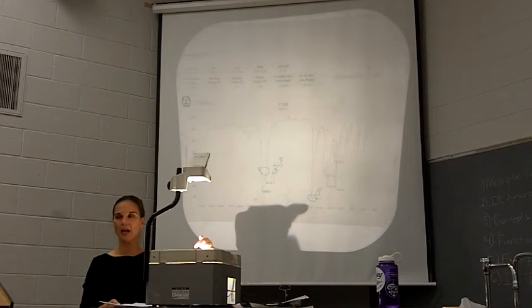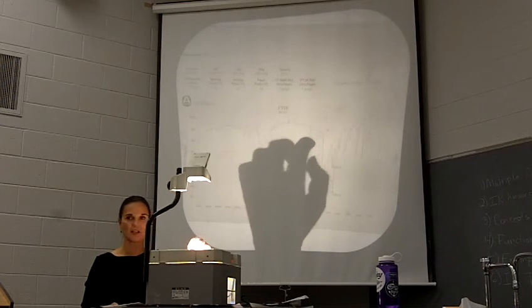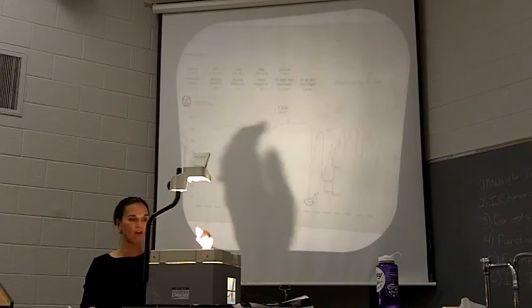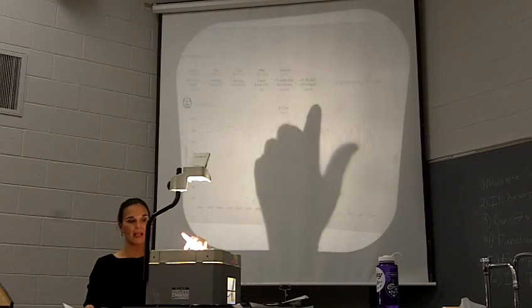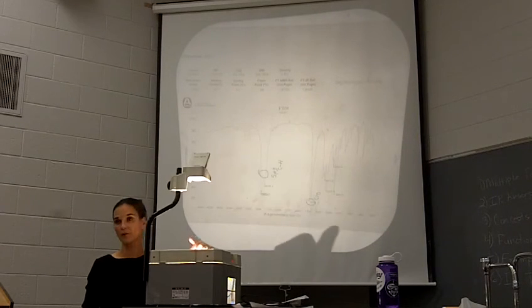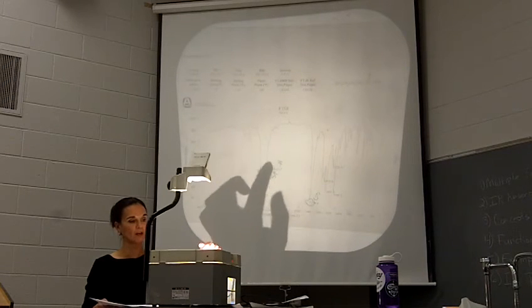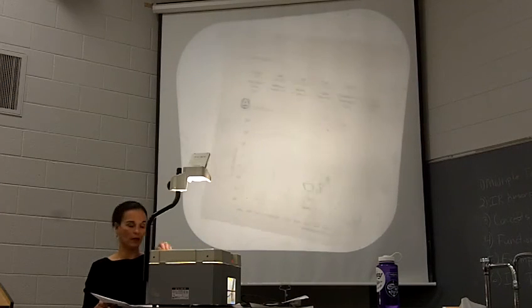Now, sometimes what happens, especially with alcohols, is your alcohol can oxidize to a ketone, to a carbonyl. So you'll see the huge OH stretch and a little carbonyl stretch. That's probably impurity in your alcohol, not that you also have an alcohol and a carbonyl, okay? If you have a compound that contains a carbonyl, it's going to be a very intense stretch, okay? And so you would mark that, you would mark your sp3 CHs, and again, you can mark your bending down here.